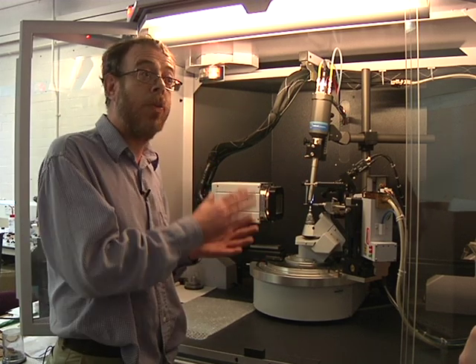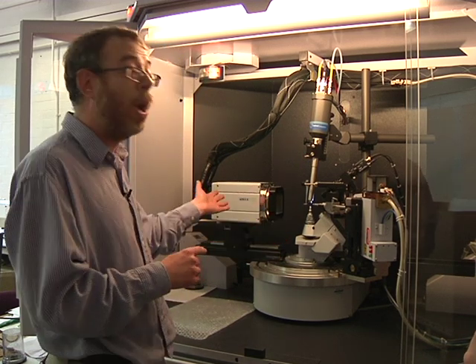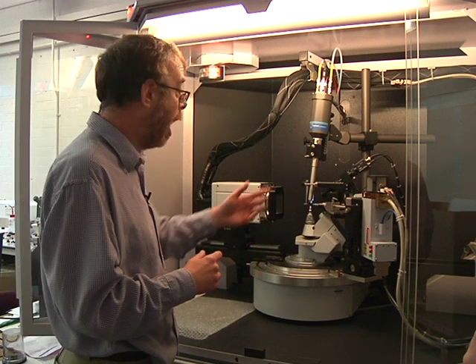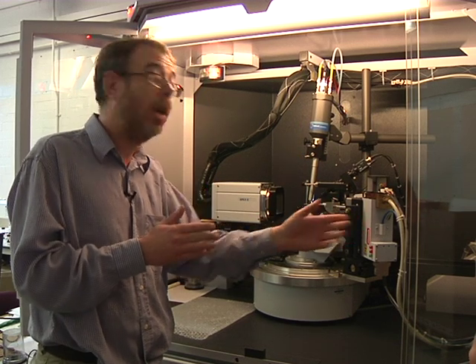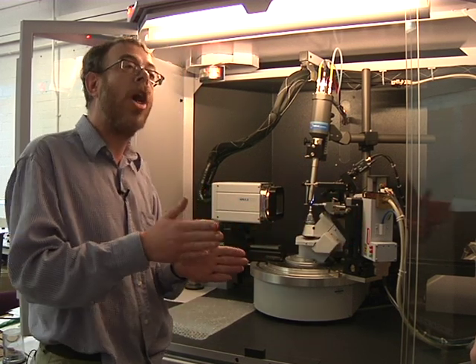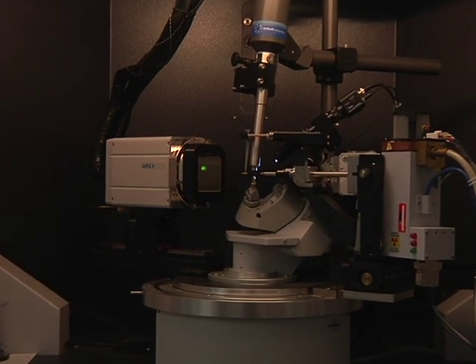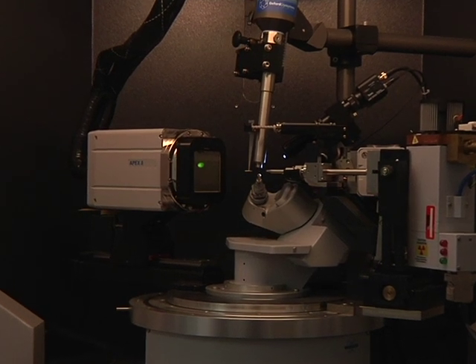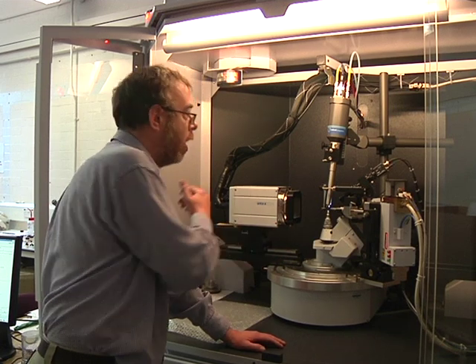Of course, we've got our x-rays and we've got our crystal. We want to see what that picture looks like — it's like a snapshot — and where we have a camera. What happens is, we have our crystal, our x-ray beams come in, and some of those x-rays are diffracted at different angles, and this machine measures that diffraction. A machine like this is really quite state of the art. With it, we can find out the atomic level, which is very difficult to do. But with the right kit, with the right detectors, the right temperature, you can actually get a really good picture of the molecular structure.